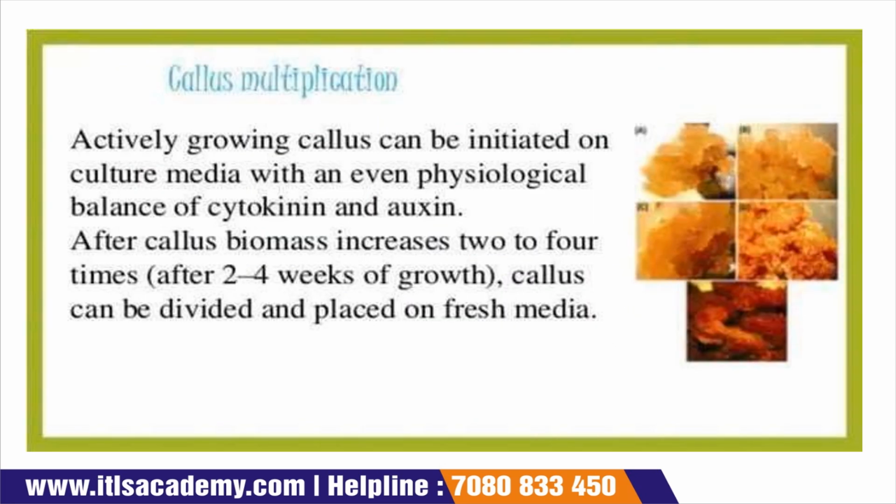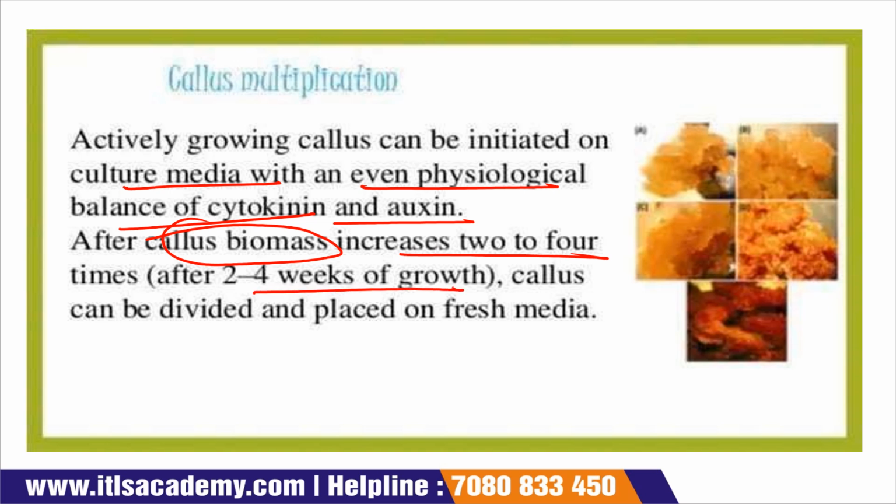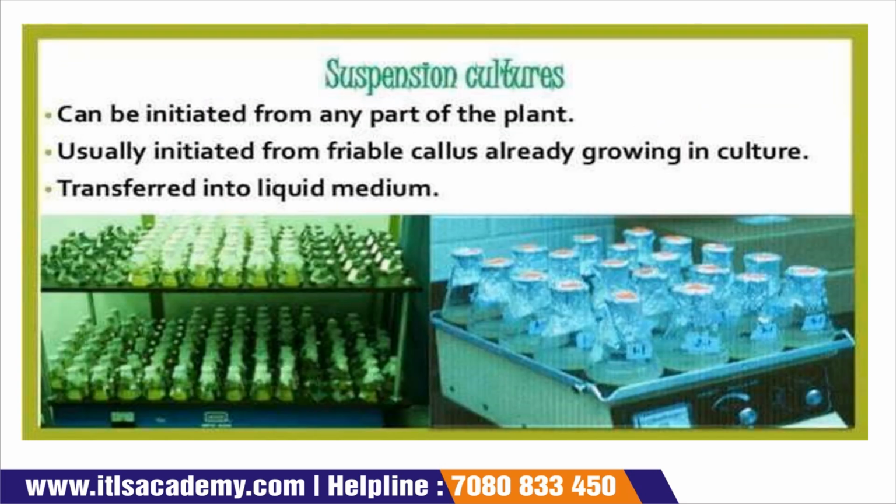Callus multiplication. Actively growing callus can be initiated on culture media with an even physiological balance of cytokinin and auxin. The biomass of the callus increases 2 to 4 times after 2 to 4 weeks of growth, then the callus is divided and placed into fresh media.